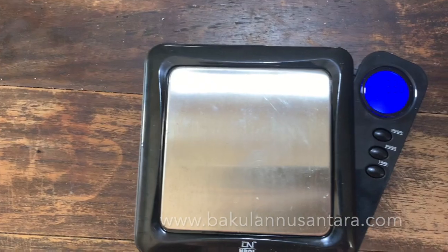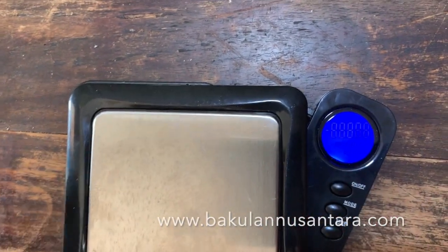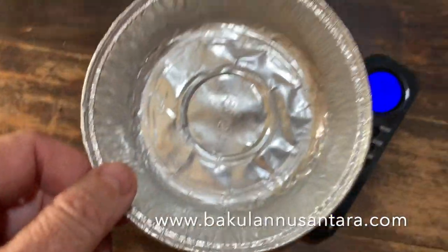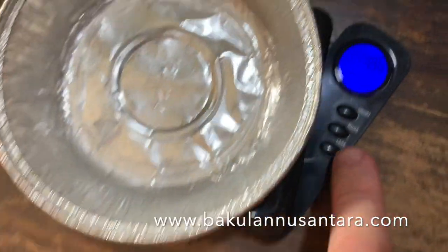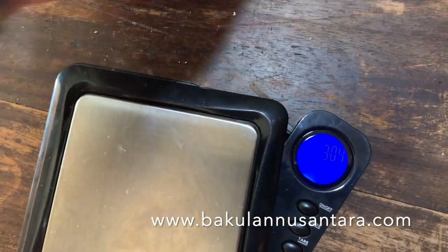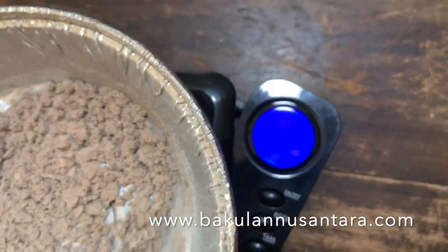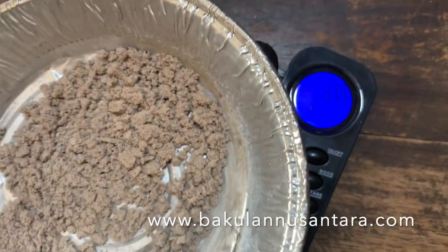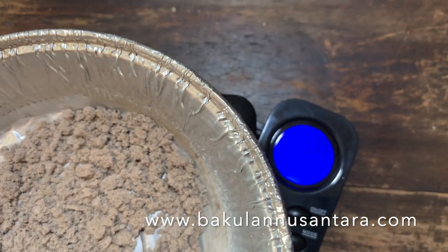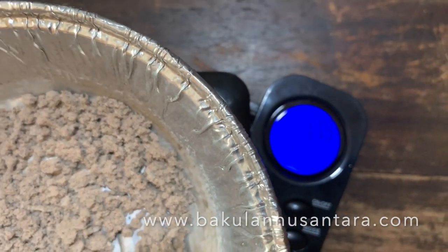We're going to use our digital scales. We weigh and zero off a similar weight dish, because we want to measure the ash, not the dish, so it's back to zero. Putting our ash on the scales, we see a weight of 1.79 — let's say 1.80, just to round it up to the next hundredth of a gram.